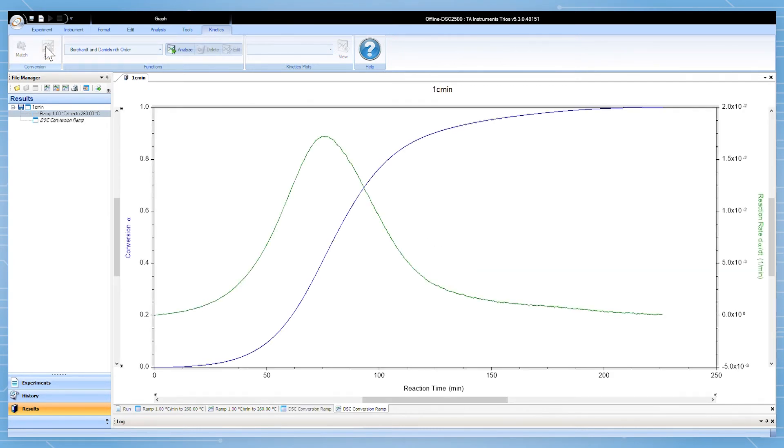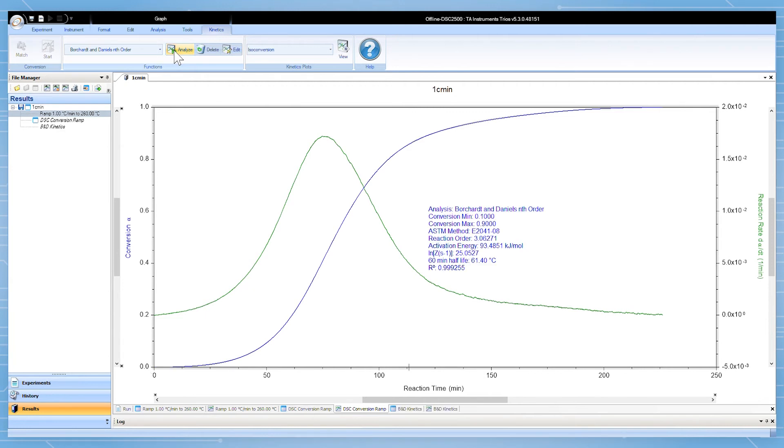Then select the converted file and pick Borchardt and Daniels nth order in the drop down. Click analyze. The Borchardt and Daniels analysis will be applied and the resulting kinetics parameters displayed on the graph.